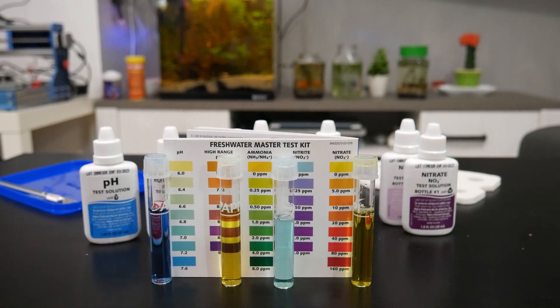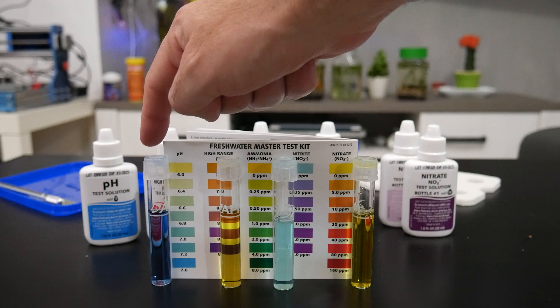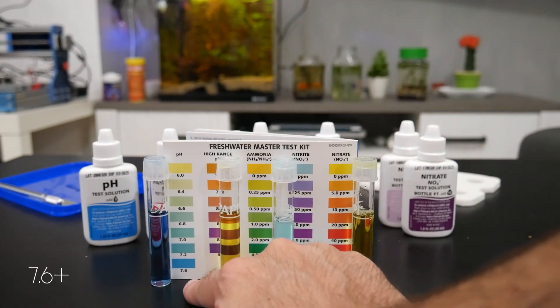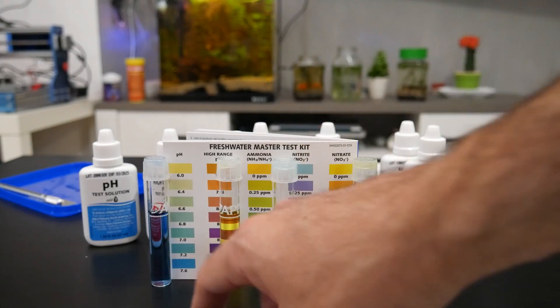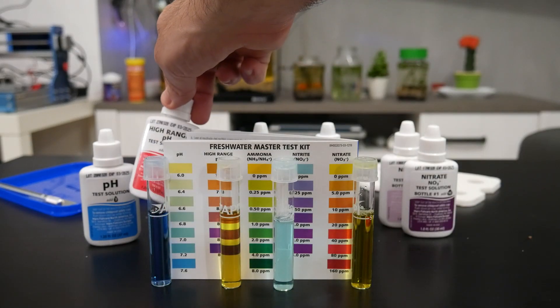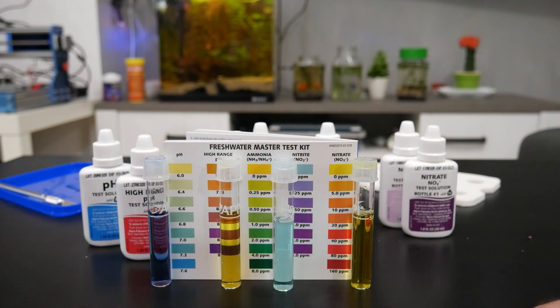So here are the results. If we examine the pH tube, we can see that it's maxed out in this chart around 7.6. So we need to check with the high range pH values. We'll do it right after this.